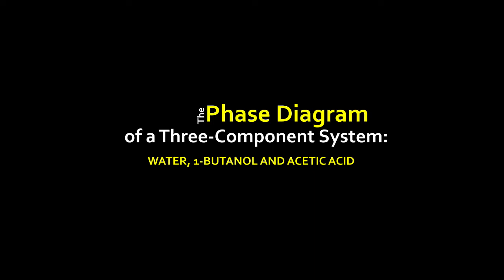And then after that, I'll go right into actually doing the lab and showing you everything, all the different parts and how they come together to be able to calculate this phase diagram.